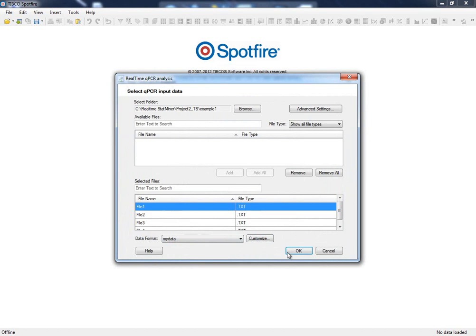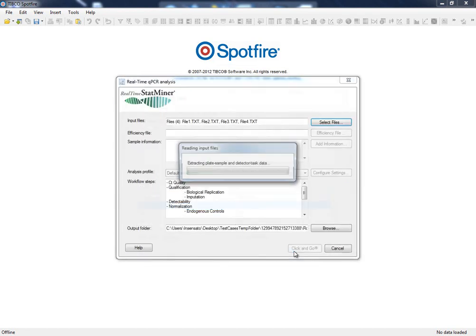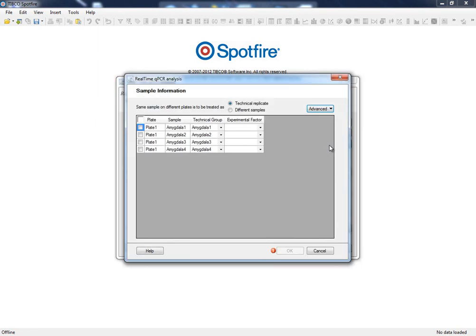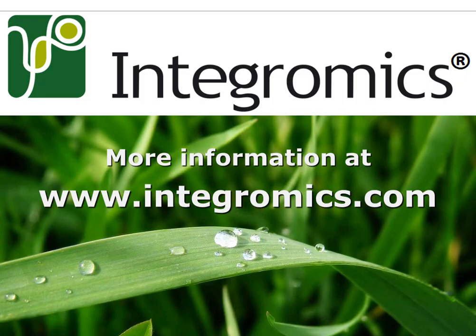We recommend that you continue your training by watching subsequent tutorials on how to define experimental design prior to configuring your settings for click and go analysis in TIBCO Spotfire.